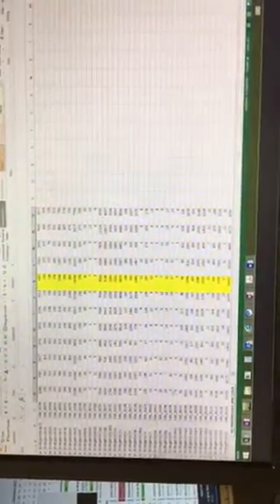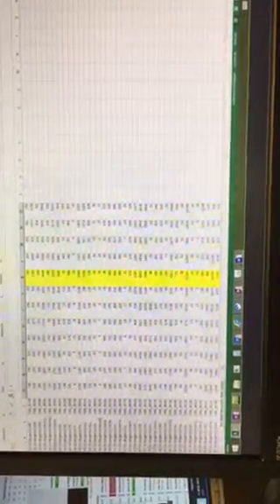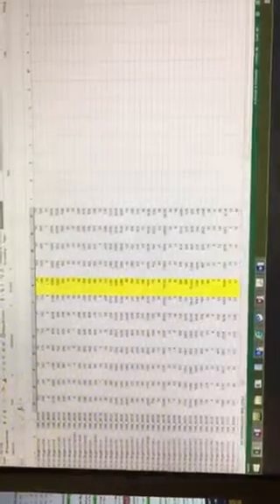And as far as the endogenous counts go, you see a nice range. Certain ones are expressing at background, and others are expressing quite robustly. This is a large code set, so not every sample is going to express, and some are going to express very highly. But this is actually a nice data set here.